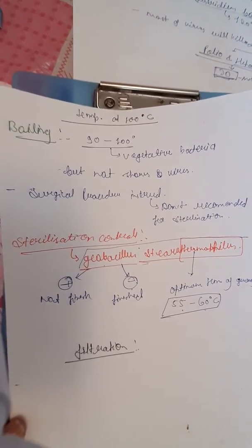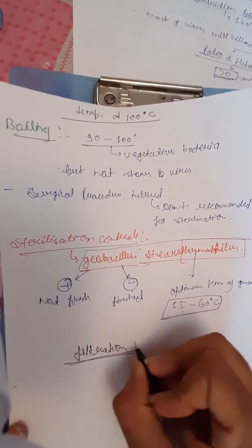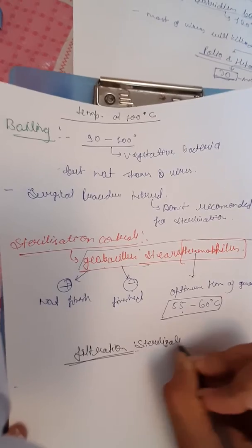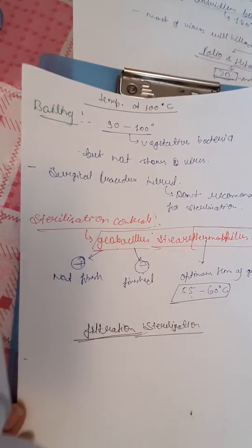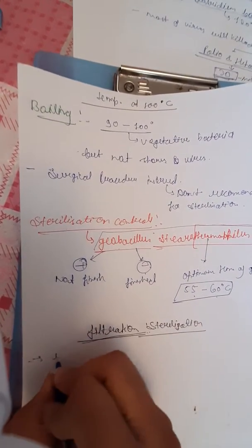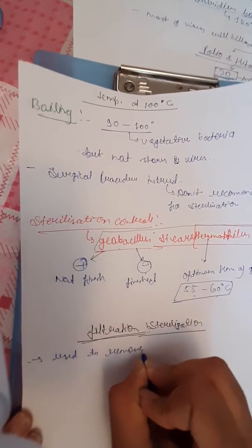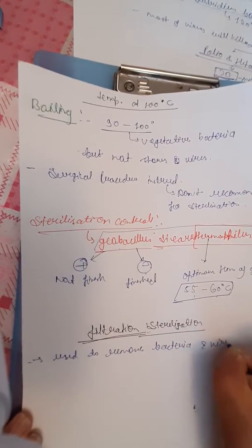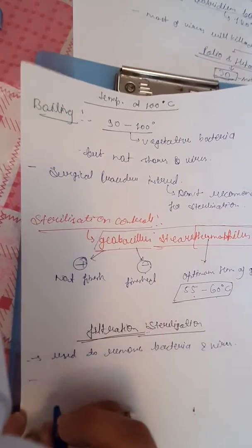Now we will continue the lecture, that is filtration sterilization. It is another method. In this method we remove bacteria and viruses, but toxins of bacteria can remain there.